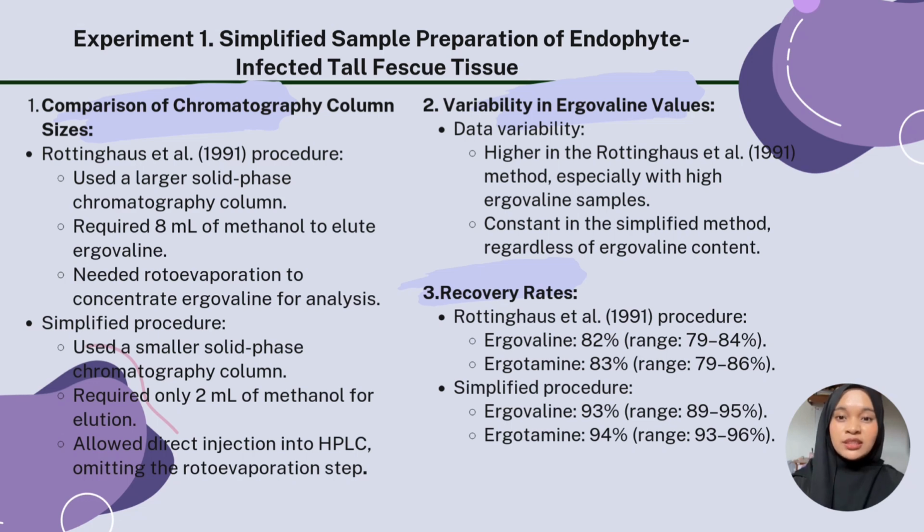More consistent results produced by the simplified method can be attributed to the omission of the rotor evaporation step because, 1. Ergovaline apparently sorbs to glass when taken to near dryness following rotor evaporation, and 2. rotor evaporation to a constant near dryness is difficult and subjective.